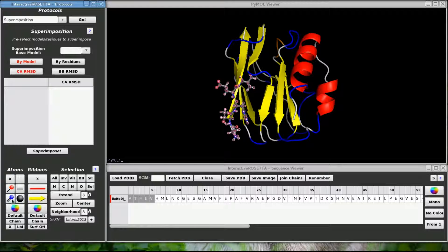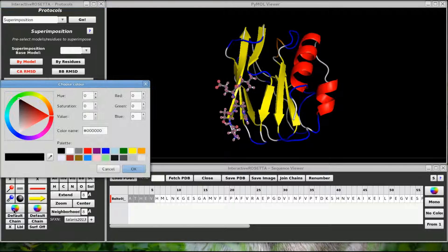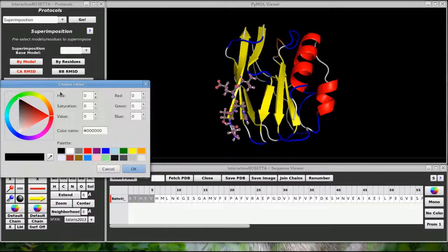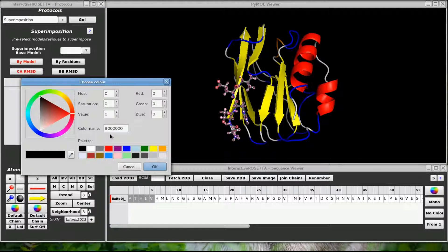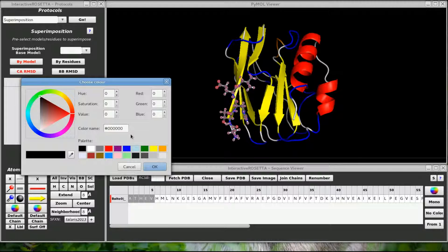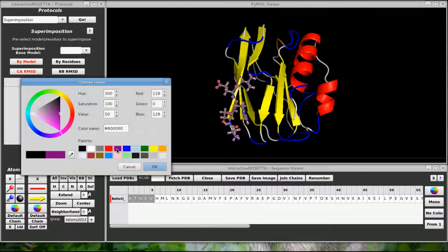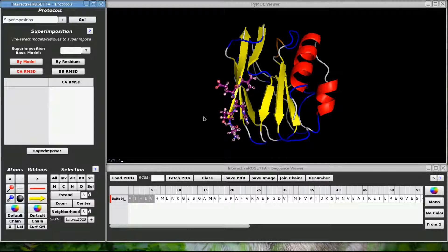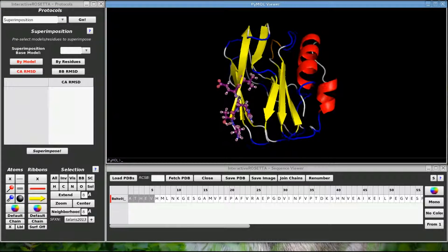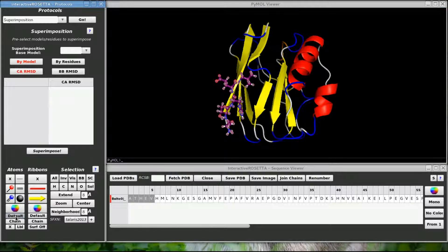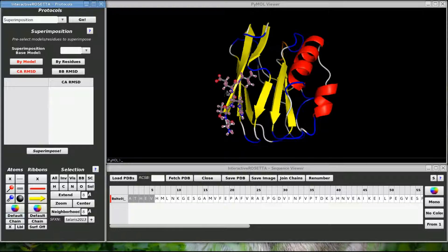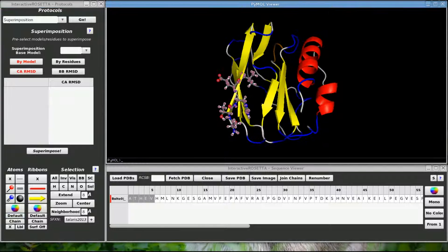The color wheel down here allows me to recolor the carbon atoms. This little widget will look different depending on whether you are in Windows, Mac, or Linux. So let me color the carbon atoms purple because, why not? Now the carbon atoms are purple. Selecting default changes the atoms back to their ordinary colors.